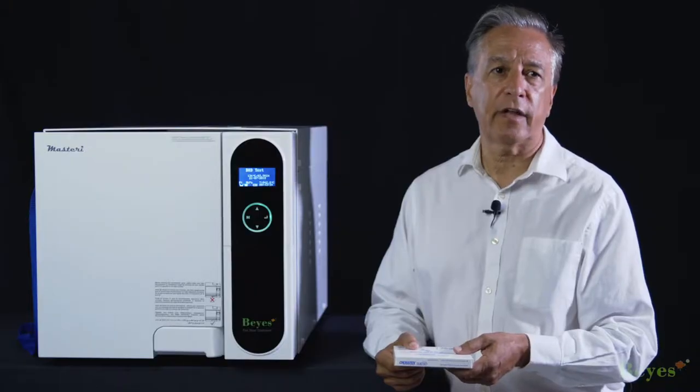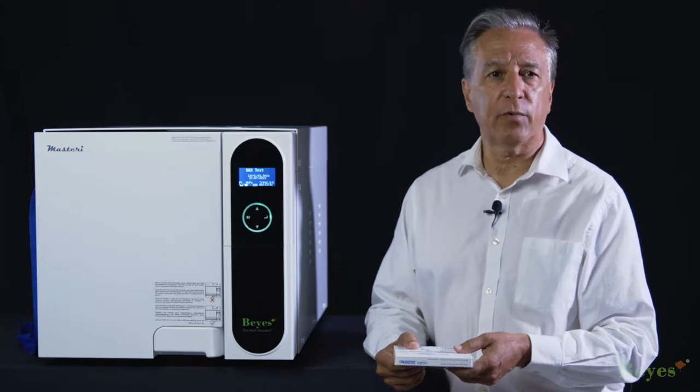The Bowie-Dick test is a standard operational test by which hospitals and laboratories can demonstrate proper air removal from the vacuum autoclave chamber. The Bayes Mastery Autoclave is programmed to do the Bowie-Dick test with a press of a button, and it's recommended to be performed daily.